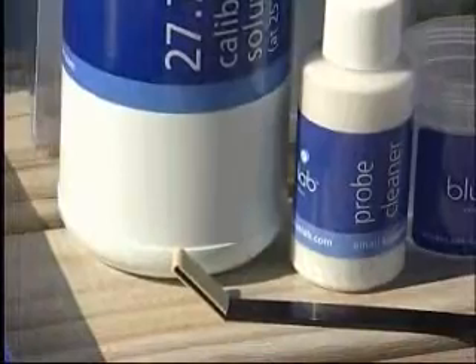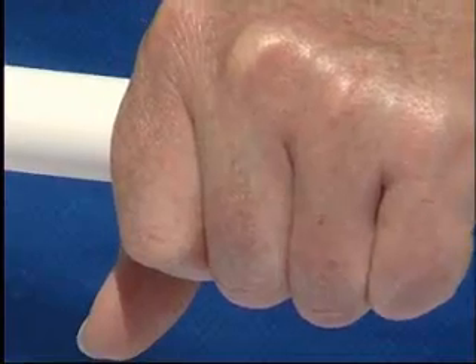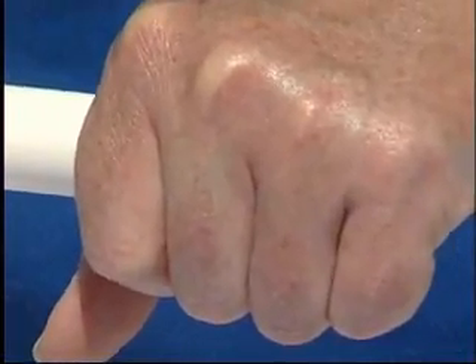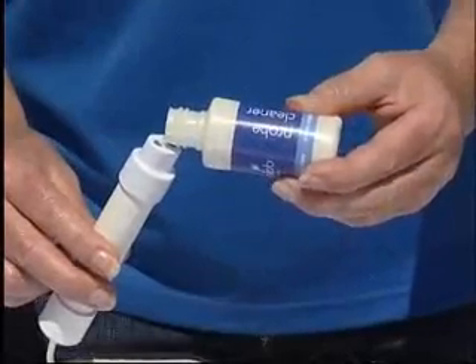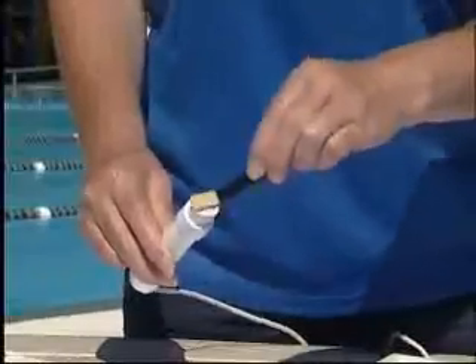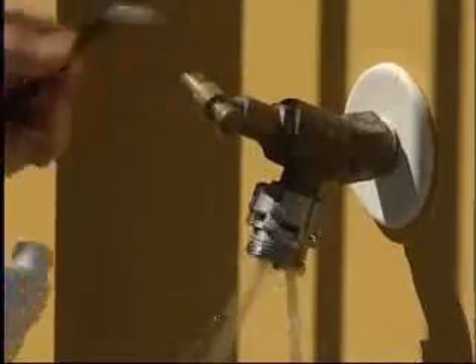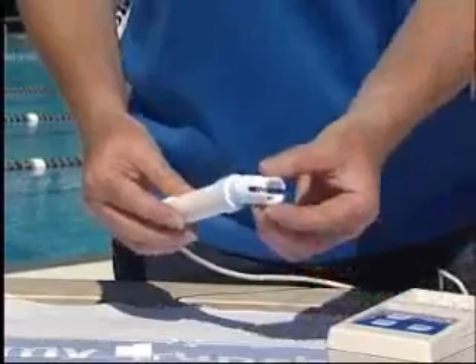To clean the conductivity probe, remove the shroud by putting your hand over the probe shroud. The heat from your hand will expand the plastic and help with removal. Place some Bluelab probe cleaner onto the probe face. Use the Bluelab chamois to scrub the probe for about 10 seconds. Then rinse the probe under running water, rubbing with the other side of the Bluelab chamois. Replace the shroud, pushing firmly.